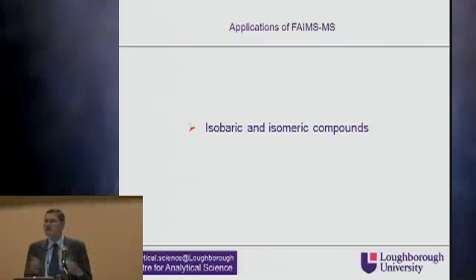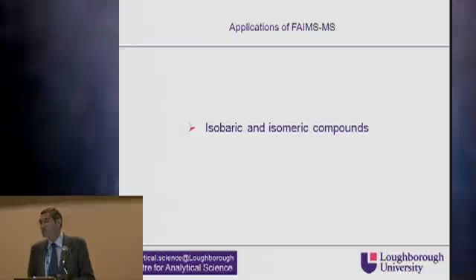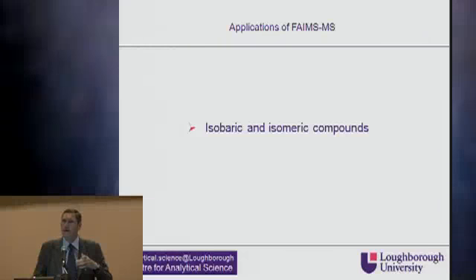Okay, so in the remaining 20 or 25 minutes or so that I've got, I've tried to set out some examples of applications of FAIMS to pharmaceutical and bioanalysis from our laboratory. It's a snapshot really of the work that we and others have done. I've just tried to pick out a few examples which I think illustrate some of the essential and interesting features and the potential that FAIMS has.